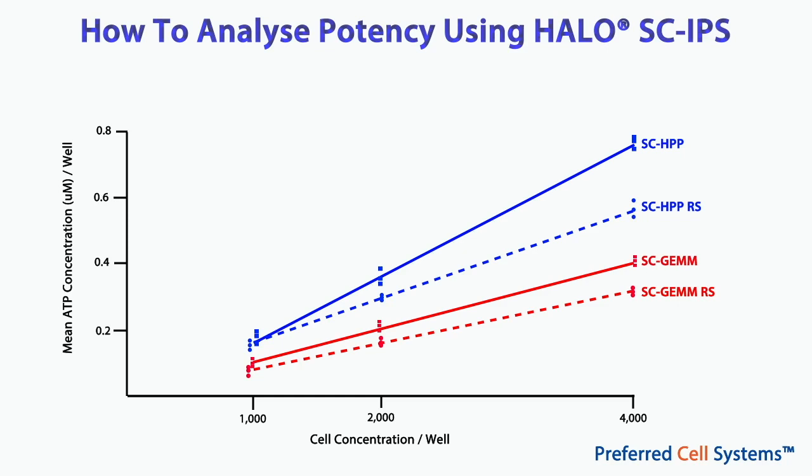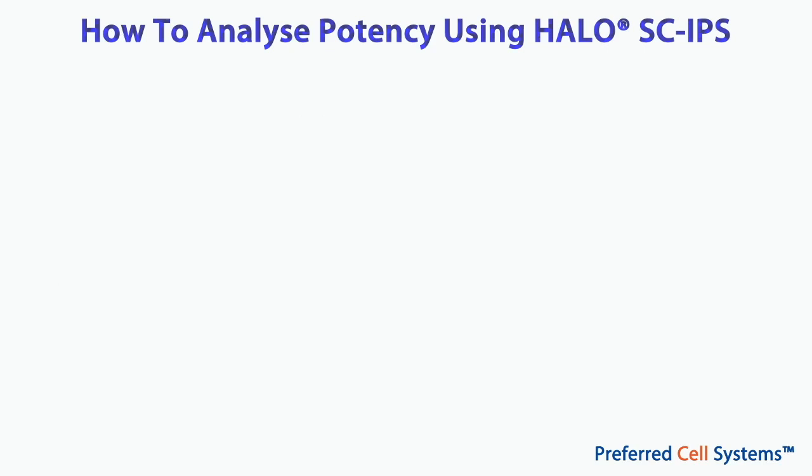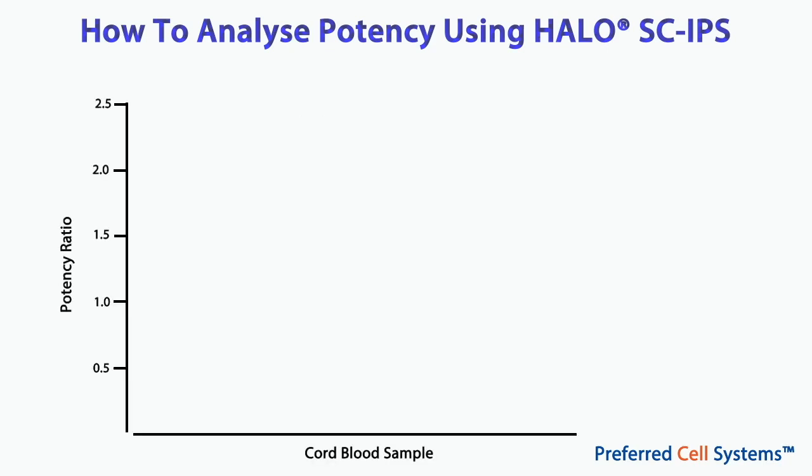The amount of ATP concentration at a particular cell dose gives you the proliferation ability, or a quantitative determination of stem cell quality. Now we have to focus on the slope of the graphs. From the linear regression parameters, divide the slope of the sample stem cell dose response by the slope of the reference standard stem cell dose response for both stem cell populations. The result is called the potency ratio. Here are some real-life results using cryopreserved cord blood samples.